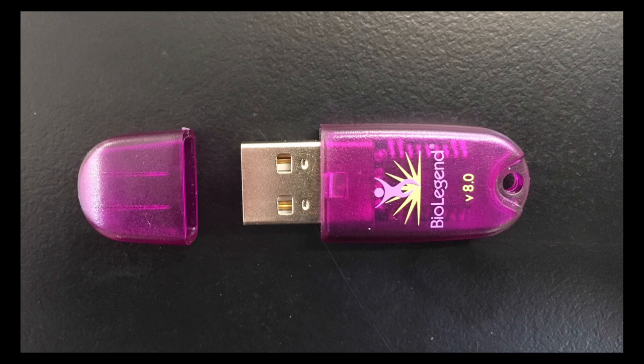Once it has been inserted, please wait at least 15 seconds for your computer to recognize the dongle, after which you may launch the software. The use of the LegendPlex data analysis software proceeds sequentially through four modular steps.